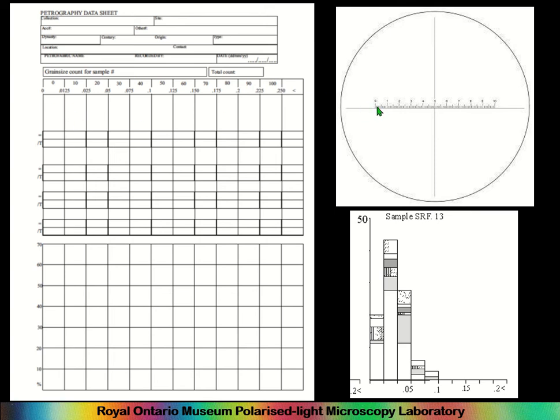So this is the graticule, which should be inside your microscope. It's certainly inside my microscope if you get to look down it. And you see it goes from 0 to 10, and here it is 0 to 10. So if you're looking at the appropriate magnification, which is 10 by 10, so 100 times magnification, these should be the dimensions we're looking at. So this is millimeters, 0.250 millimeters, and everything above, you see, so everything above.